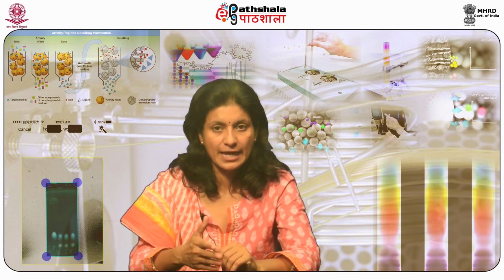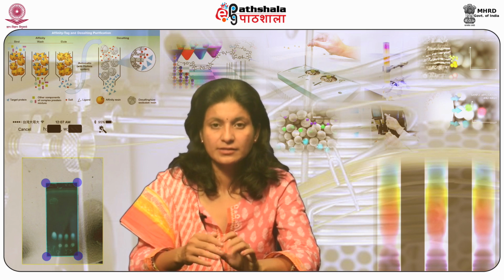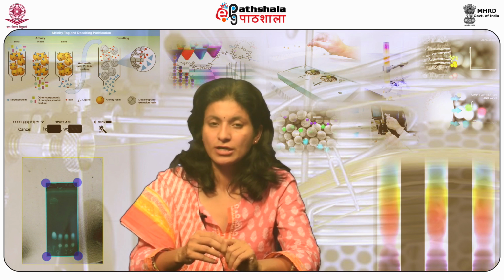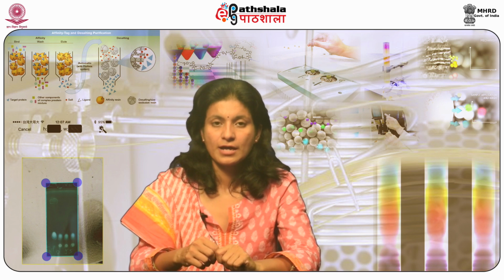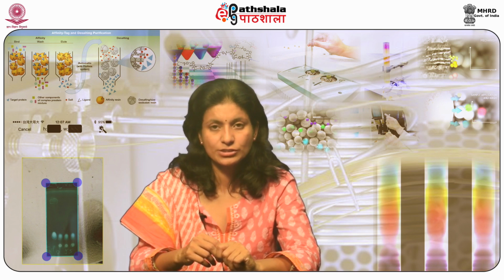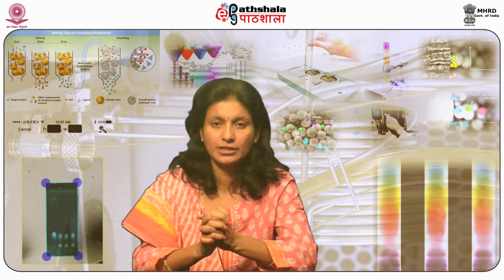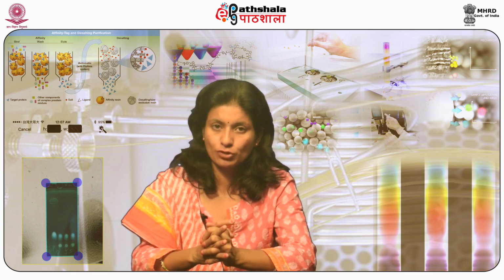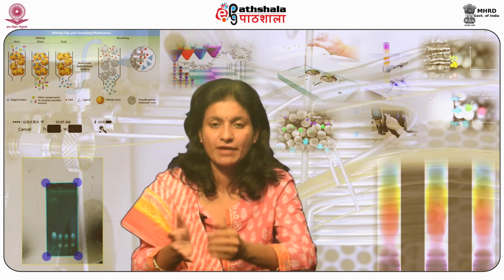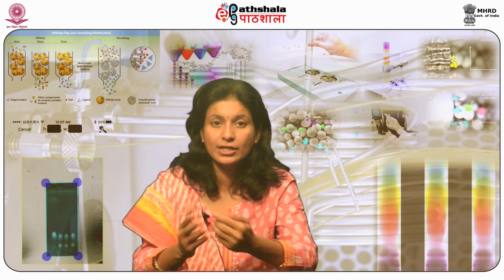It is employed on charged molecules, for example, proteins, amino acids, and nucleotides and related biopolymers of different molecular sizes and nature. Ion chromatography separation is based on electrostatic interactions between polar and ionic analytes, ionic functional groups fixed to the chromatographic support or gel, and ions existing in the eluent.